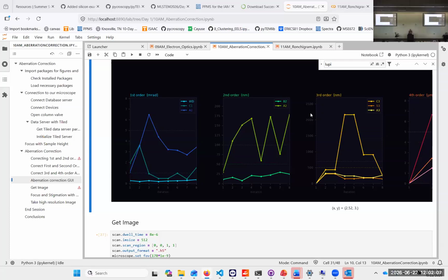So you can change the wrong aberration corrector. What you should do is, when you do the initial alignment, you use only the corrector astigmatism. And after that, in order to be able to set it back to zero, you should only use the condenser stigmators that you go in. And that should change stuff.